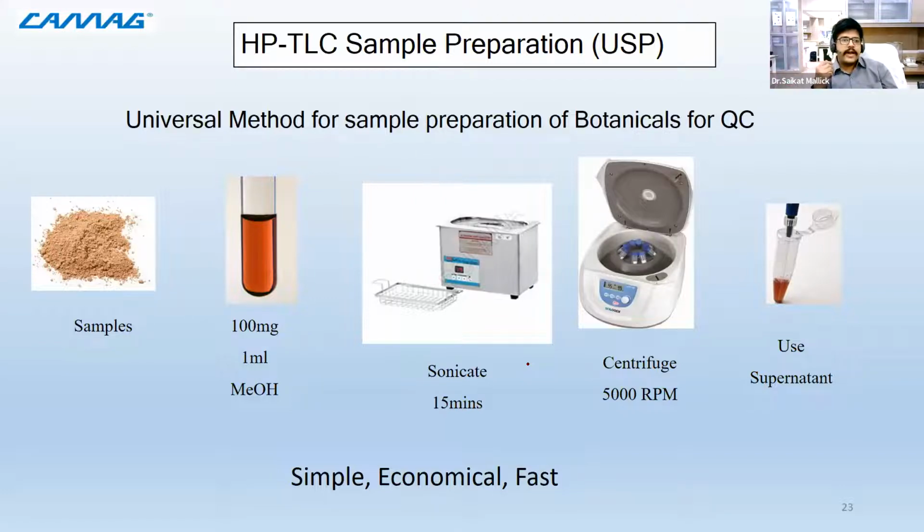If I have something to investigate, I'm developing a methodology. If you make it more critical, it is not adopted by industries to screen samples and things like that. So it has to be made extremely simple, easy to do. And HPTLC plates can tolerate high matrix.